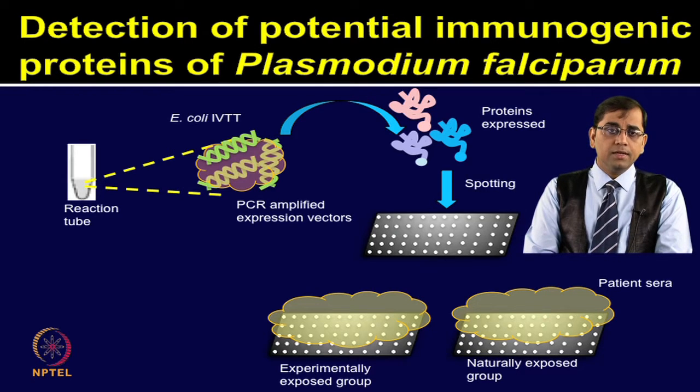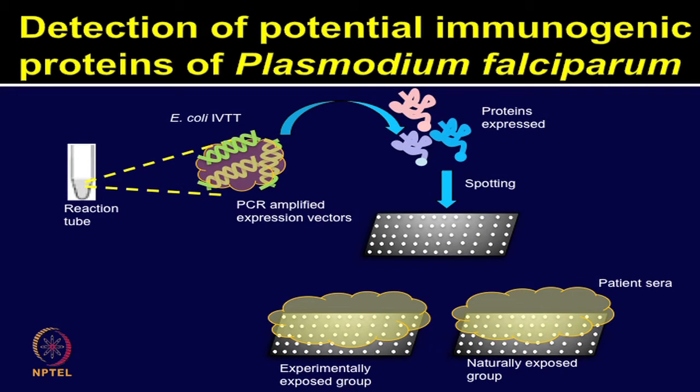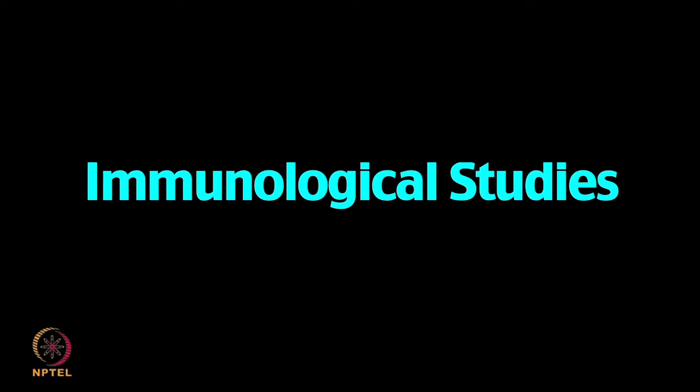The proteins expressed specifically in the pre-erythrocytic stage of Plasmodium, which was CSP, as well as some liver stage specific antigens such as LSA1. They also identified several proteins successfully by applying cell-free expression based protein microarrays. Let us now discuss this experiment by looking at this animation.